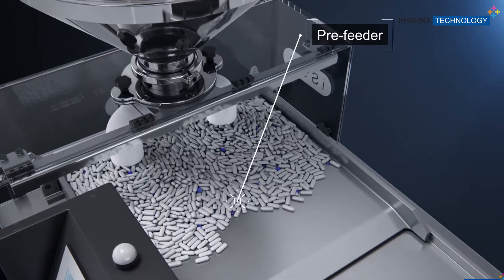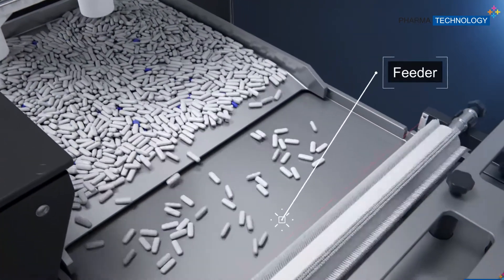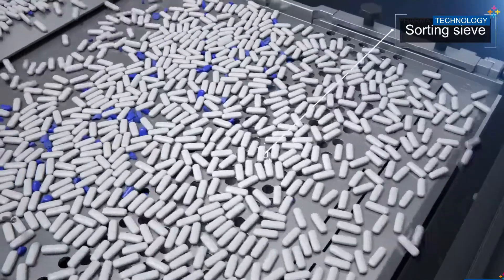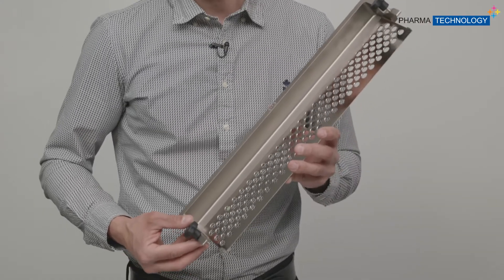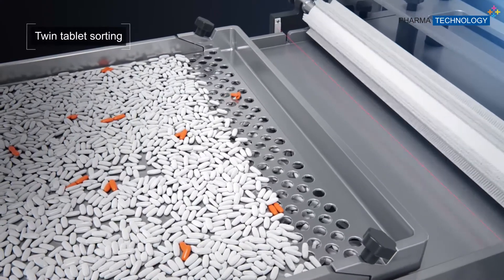After entering the machine, the tablets will then go onto the pre-feeder. The pre-feeder is a very high precision vibrating table, which is regulated by a vibration sensor. Very high precision vibration is key to good sorting. Optionally, we can also place one of those parts onto the pre-feeder, which is meant to sort twin tablets.